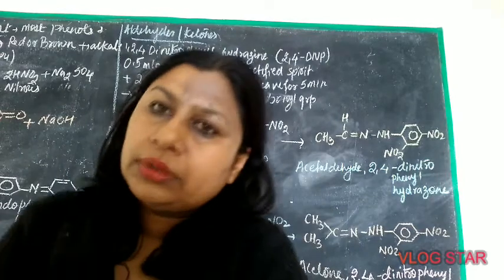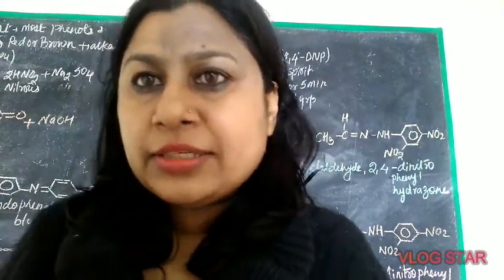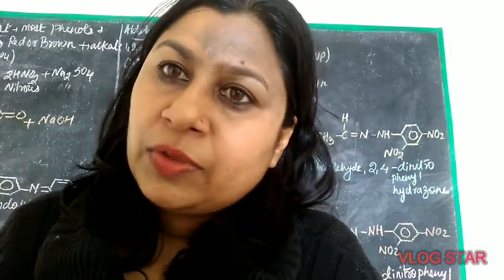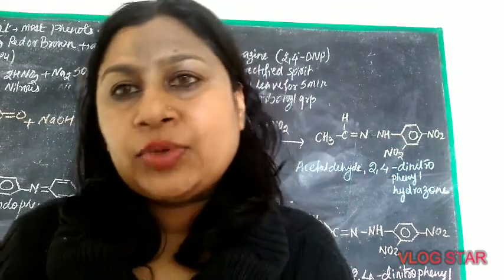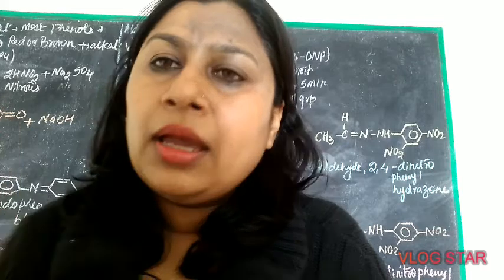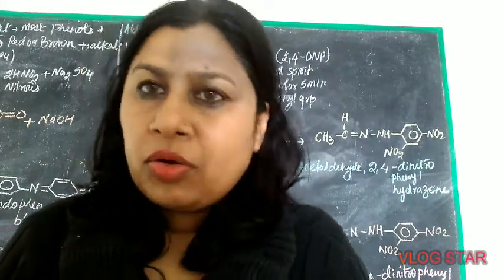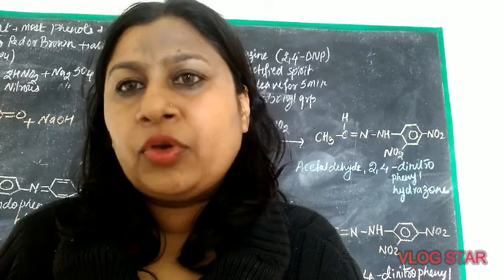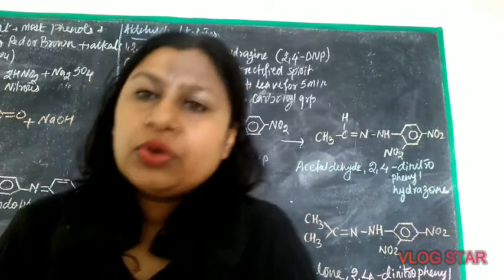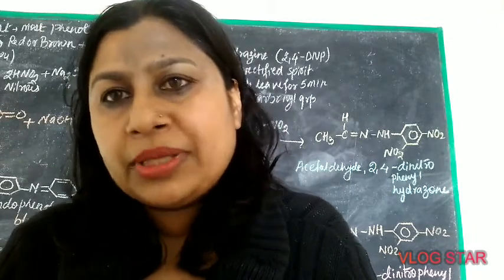Children, your ketones give the metadinitrobenzene test. The ketones give violet color with metadinitrobenzene and it gradually fades. So it confirms the ketonic group. Now the sodium nitroprusside test. If you take a few crystals of the compound and add sodium nitroprusside and sodium hydroxide, you'll get red coloration, which confirms the presence of ketone.